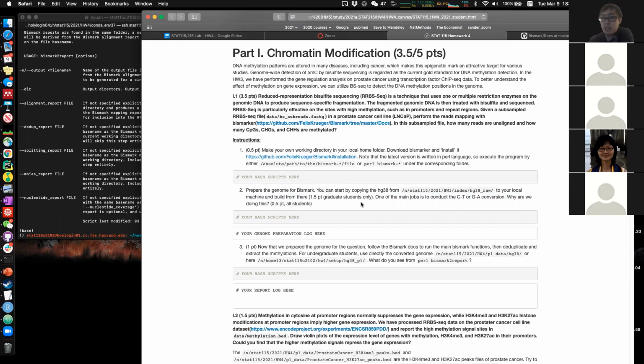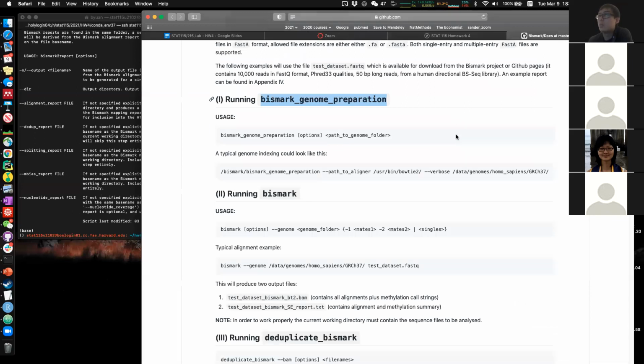We put it here as graduate student only, but for undergrad students, we also highly recommend you try to test it out and check it out, to see what is really going on, what this Bismark is really doing. Just to give you a hint, this command, the entire software, is pretty well developed and pretty well maintained, so you can directly use a single command and that gives you the preparation.